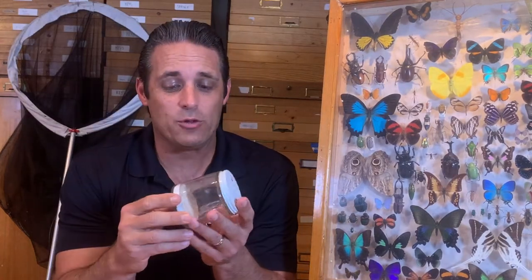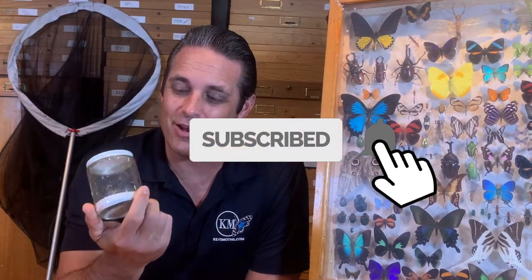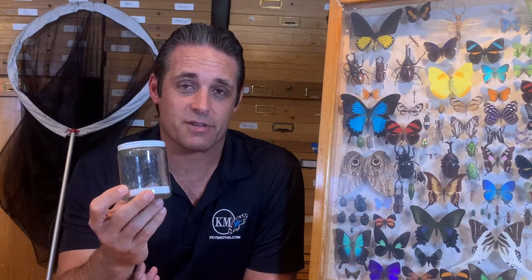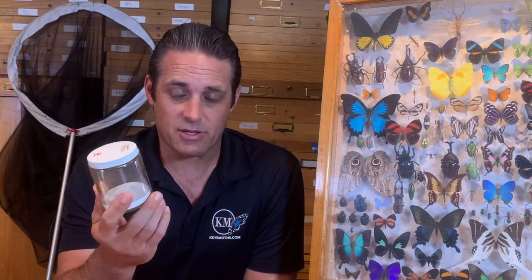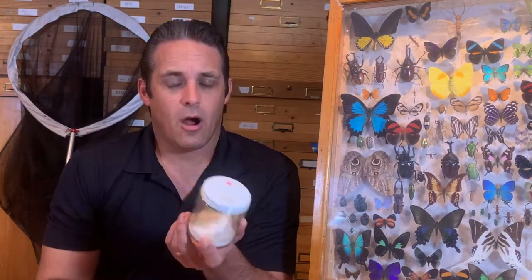Hey guys, welcome to Keys Moths, this is David Fine. I hold in my hand a kill jar, and when you're moth collecting or beetle collecting, this is a must-have. You can actually misuse kill jars and ruin a lot of specimens, so what we hope to do in this video is show you how to properly use them and some things to think about.